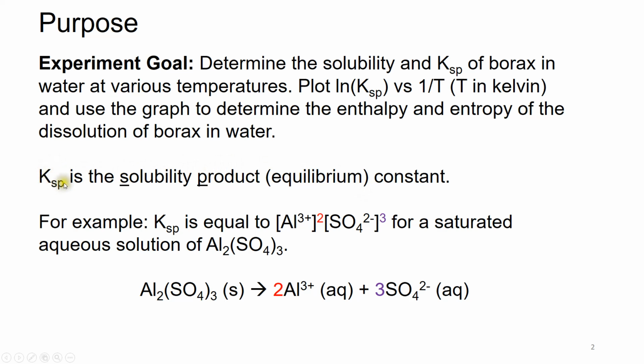Given the value of Ksp at various temperatures, we can plot the natural logarithm of Ksp versus 1 over temperature in Kelvin. And we use this graph to determine the enthalpy and entropy of the dissolution of borax in water.